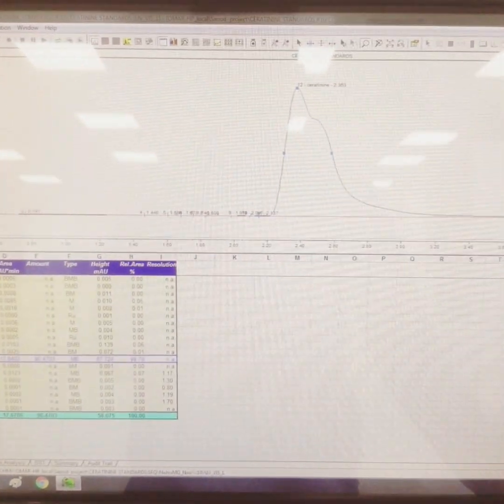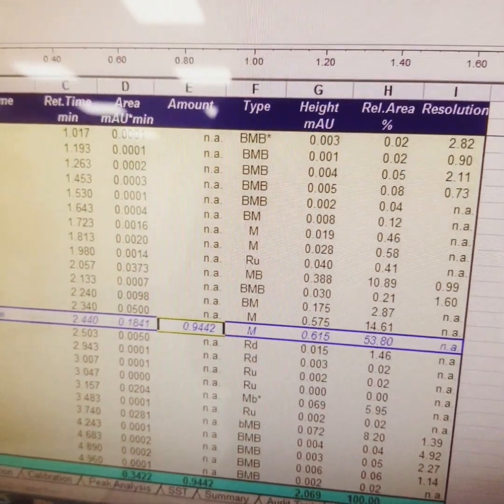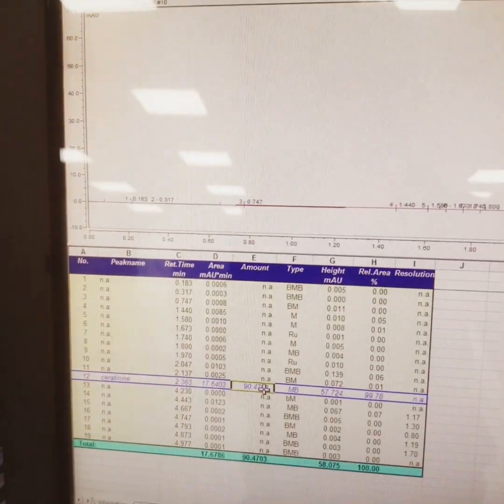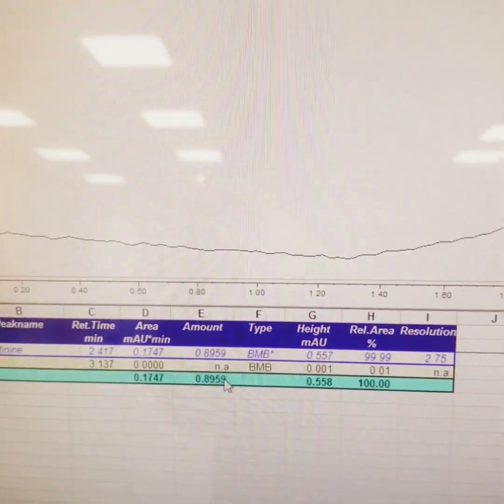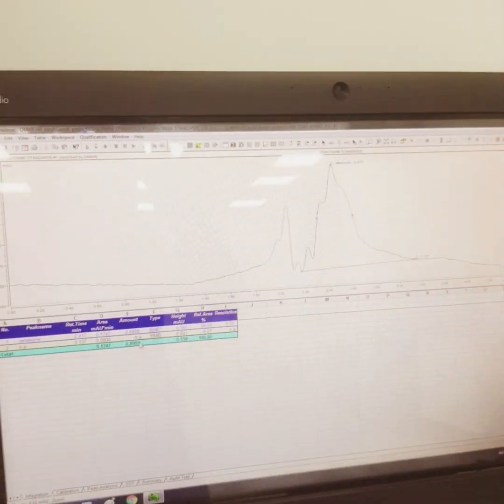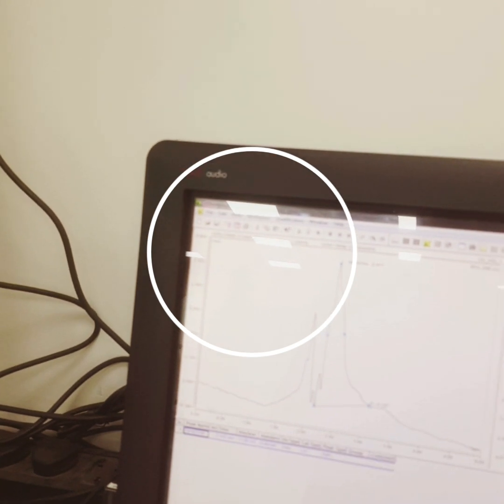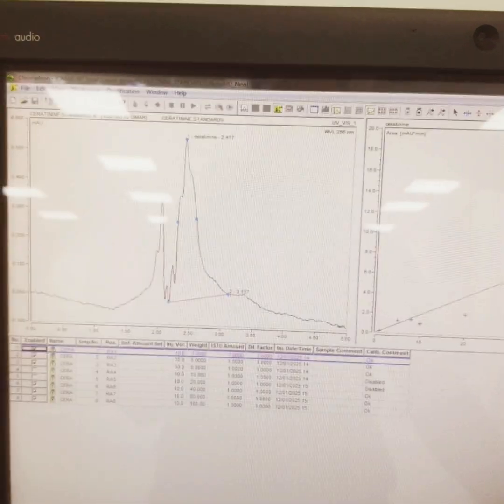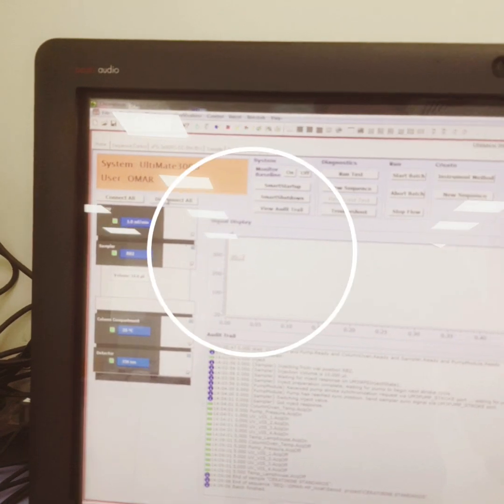In our unknown sample, suppose you want to see the concentration of the unknown sample here. The concentration is around 0.9942, which is almost equivalent to 1 ppm. And if you want to see the last one, it is around 90 ppm. This is for our first sample, which shows that the concentration is around 1 ppm. So guys, this was all about the calibration integration. For calibration, we choose the QNT editor, so you can get all the points you have entered.